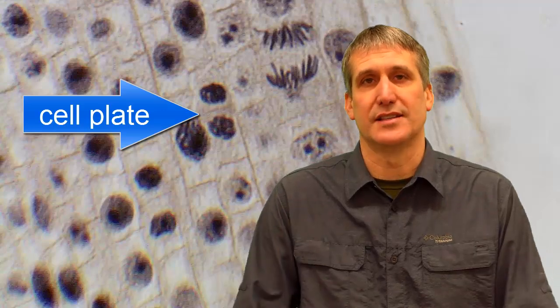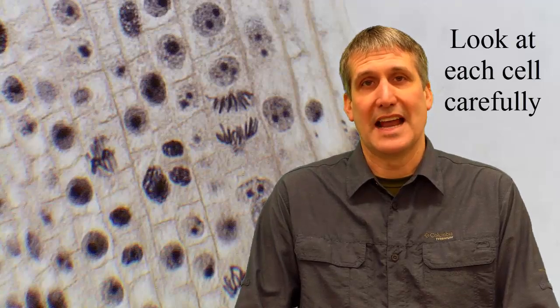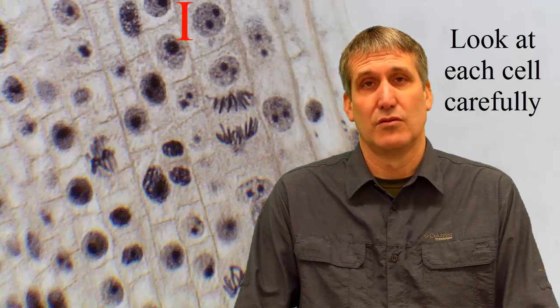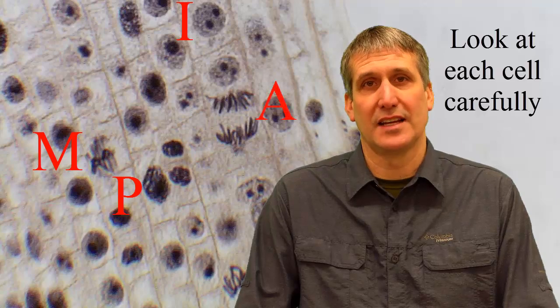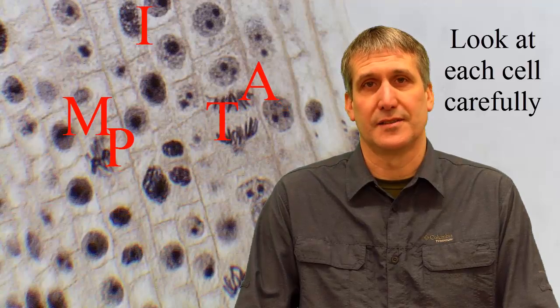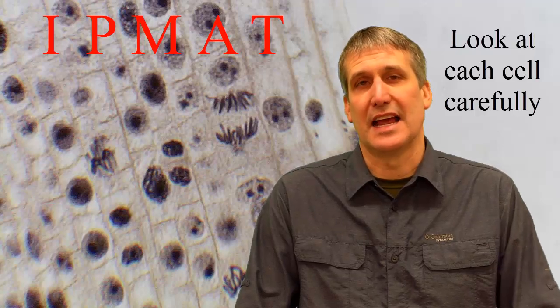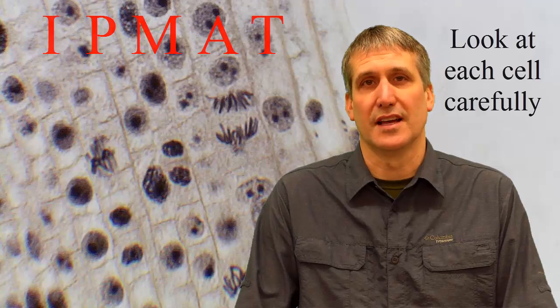This observation takes patience. You need to look at each cell carefully and ask yourself, is that cell in interphase, prophase, metaphase, anaphase, or telophase? Take your time and enjoy the observation and use it to reinforce your knowledge of the cell cycle.